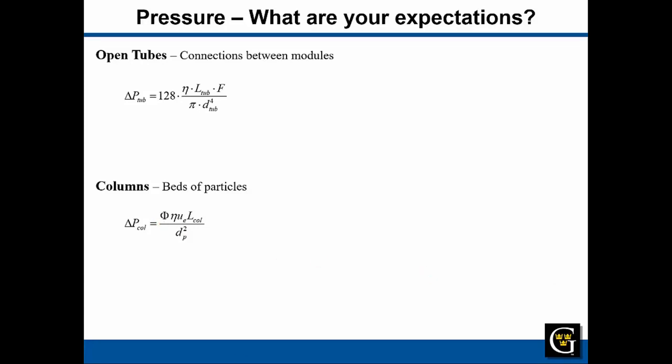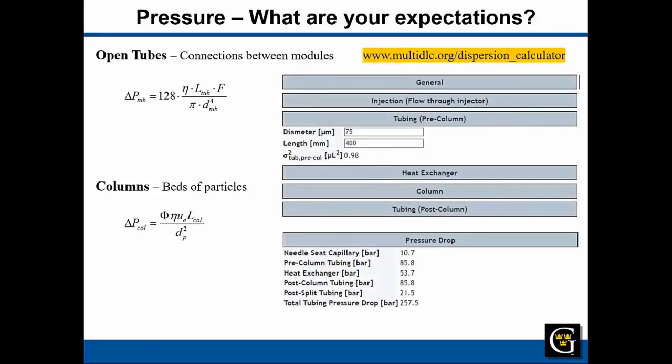Now, once we understand these equations and the terms in them, of course, we could sit down with a calculator and make calculations for specific situations, or perhaps build a tool in a spreadsheet. But I just want to make you aware that tools already exist for this, freely available tools that run in a web browser. And the two that I'm showing you here are developed and maintained by my research group.